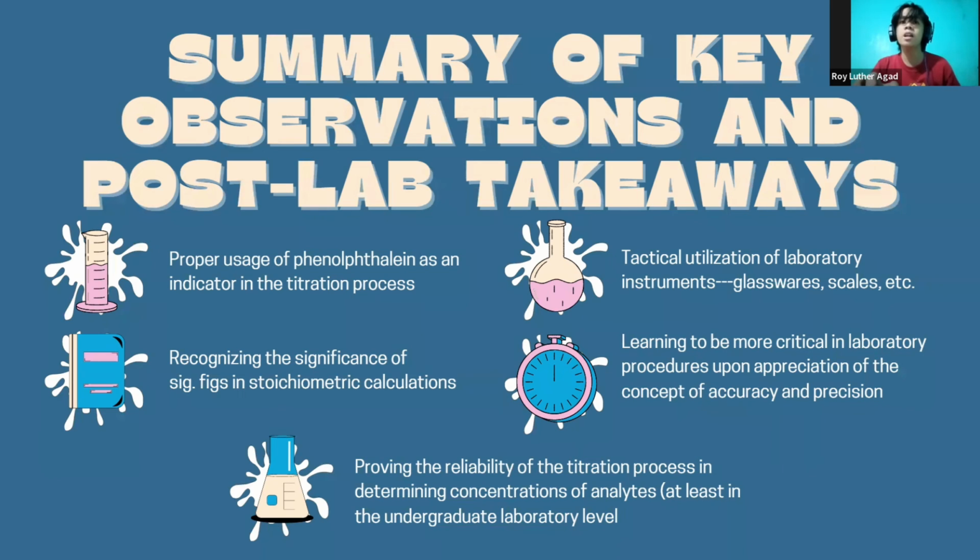Tactical utilization of the chemistry laboratory instruments, scales, glasswares, pipettes, and burettes, as well as the fundamentals of solid and volumetric measuring techniques in a virtual setting altogether constituted our primary takeaways upon finishing this exercise.